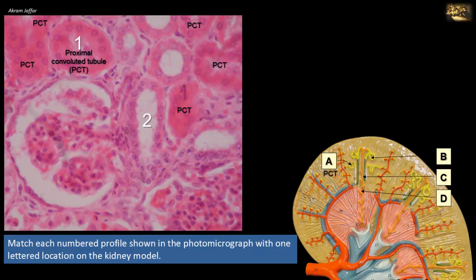Profile number two in the photomicrograph is a distal convoluted tubule. It may be differentiated from nearby proximal convoluted tubules by the following features: first, the absence of a brush border, resulting in a larger, more clearly defined lumen. Also, more nuclei are seen in transverse section, since the cells of the distal convoluted tubule are smaller than those of the proximal convoluted tubule.